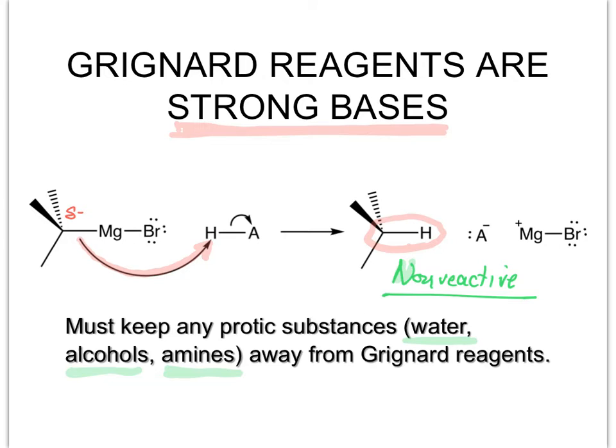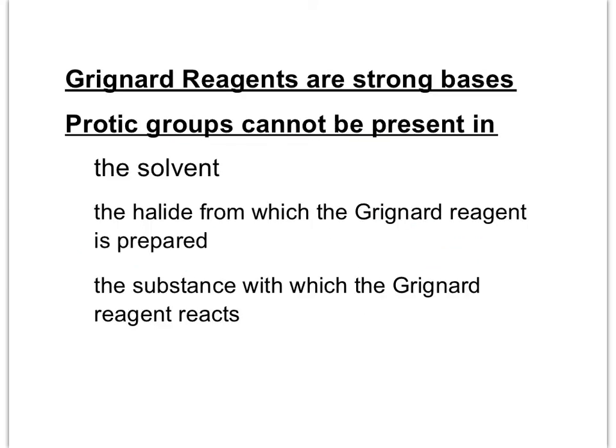You'll notice I'm going to reinforce that idea. We can't have any protic groups around, and that means in anything. We can't have protic groups in the solvent. We have to use aprotic solvents. We can only use aprotic solvents.